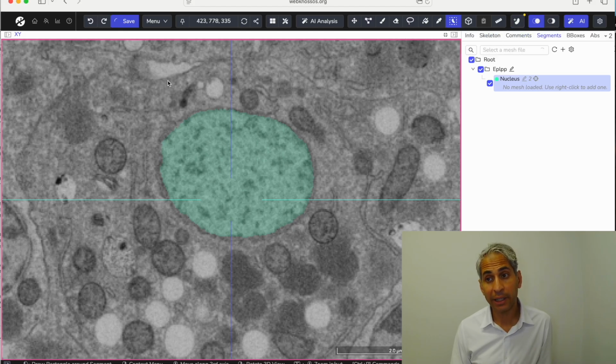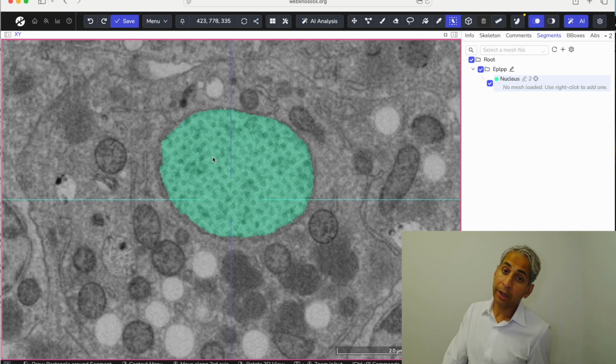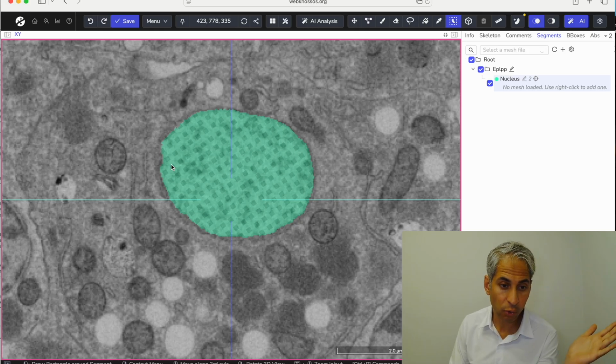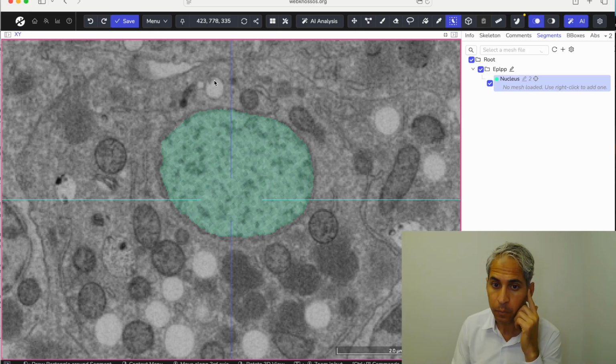Now, before I start clicking and selecting, I'm going to try to find a good mitochondria. How am I supposed to know if it's a mitochondria? Look at all this mess around the nucleus. Here, you're going to start to activate things you've learned about the mitochondria in high school all the way till today. Is this a mitochondria? No, probably not. This is some kind of droplet.